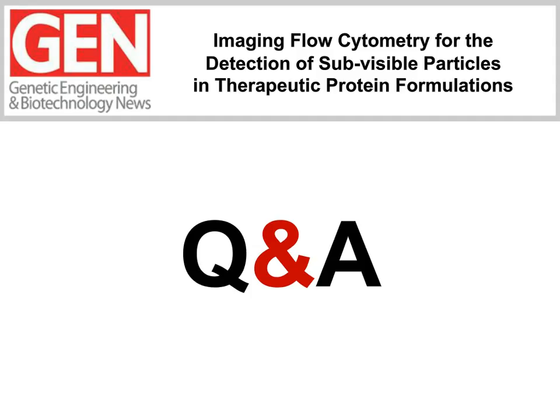Yeah, this is absolutely a possibility. So, for example, we've used thioflavin T and been able to measure that on the imaging flow cytometers, which is a measure for hydrophobicity. Basically, there's up to 10 fluorescent channels that the system can image, so as long as your dye falls in a separate channel than what's being used to detect the protein aggregate, then you should be able to measure that chemical property separately.